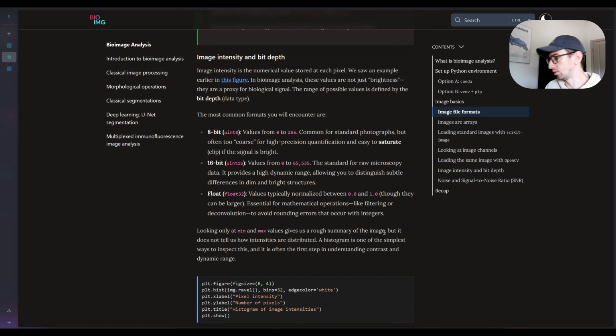Do you have any thoughts about it? For example, what are the advantages and disadvantages of these types? Something that comes to your mind. Resolution, occupied space. Yeah, occupied space.